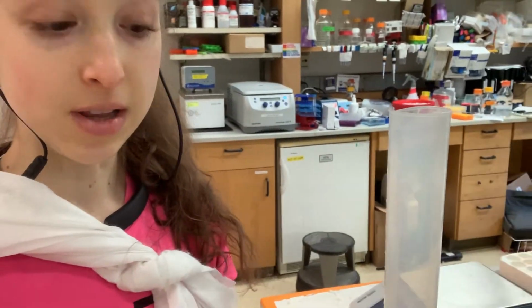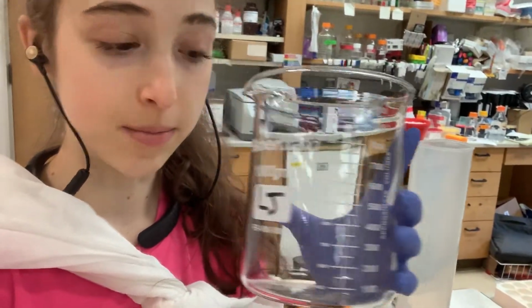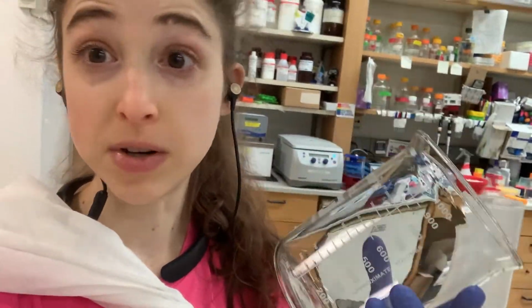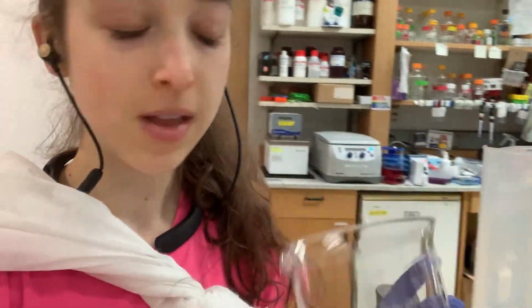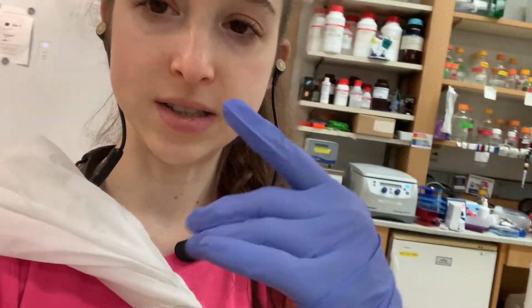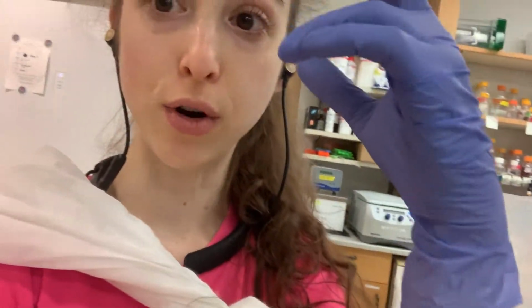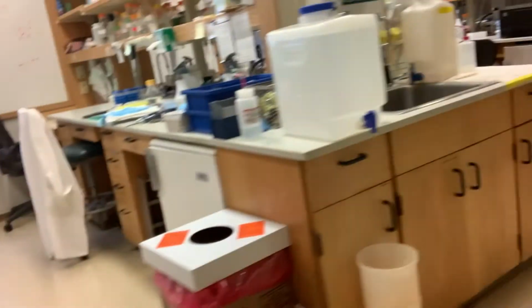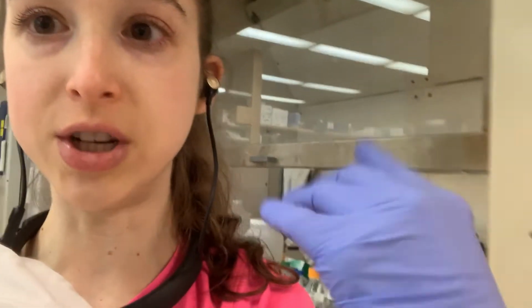Typically, if I'm making it from solids, I'll dissolve the solids in, say, 700 milliliters if I want to make a liter. I'd do this in a beaker with a stir bar on a stir plate, with the pH probe above the stir plate. You can set it up like this, with your probe in the solution as it's mixing.